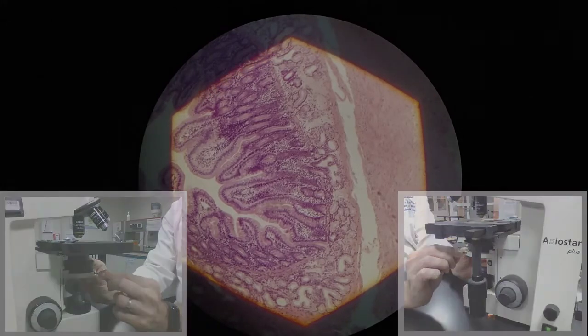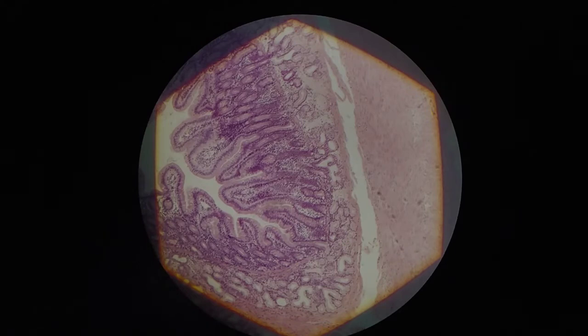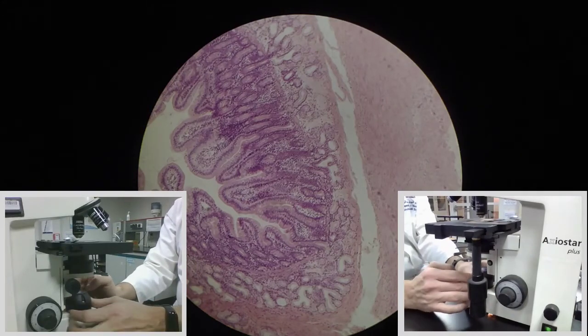That's a little bit closer. I'm going to open up the field iris diaphragm a little bit more to get this shape to open up and see if I need to center it more. What you can see right now is that pretty much all of the corners of this shape are touching the edges of the field of view at the same time. So now we can consider this to be centered. I can open up the field iris diaphragm completely and get the best possible view of my slide.